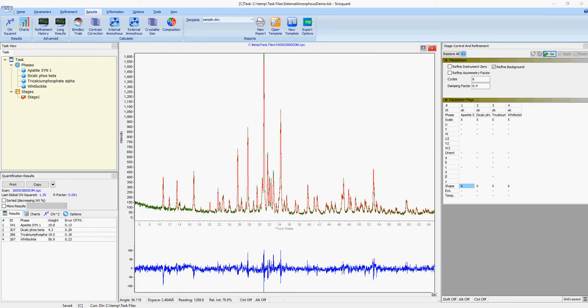The standard should be run at the same time as the sample and refined as normal, as the results will be used when determining the amorphous content. One point to note on using the external standard method is that chemistry is required as we need to know the mass absorption coefficient of the sample.